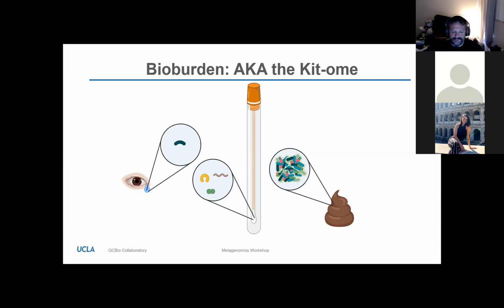So it's also not just a question of things like beads, but the sintered glass used in the extraction filters that people run their DNA through, basically the silica matrices. Those can come in also with their own biofilms on them. Those can also come in dirty. And this is something that's not completely appreciated. For some samples, it's not actually even an issue, and this will give you an idea of how it happens and can be an issue.